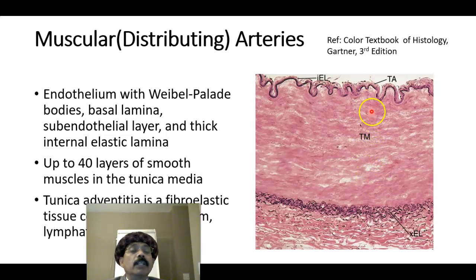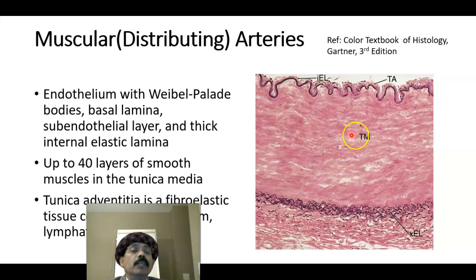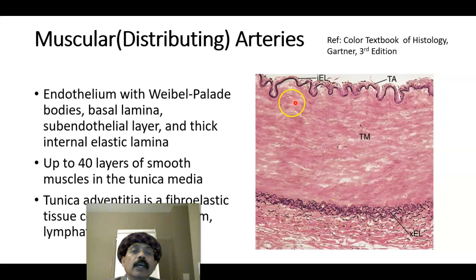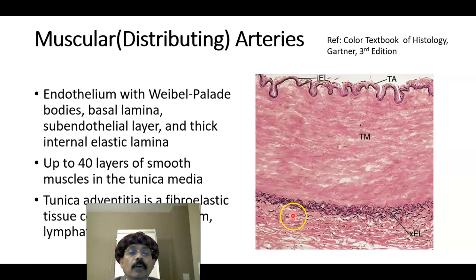A small muscular artery may have only five layers of smooth muscle. Elastic fibers are present in between the smooth muscles, and these smooth muscles are slightly smaller than the smooth muscles of the intestine. In this slide, the internal elastic lamina is very prominent in the muscular arteries, also called distributing arteries or medium-sized arteries.